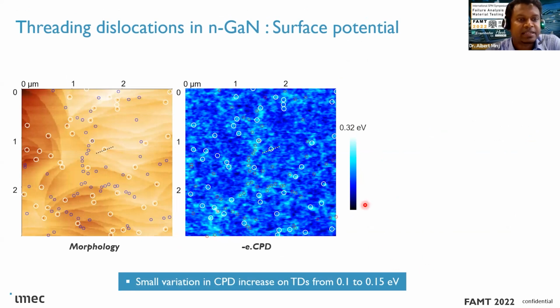For the N-type semiconductor, if a defect has a depletion region around it, which is going to be positive charge, it will result in an increase in the conduction band around it, or we can say an increase in the surface potential.